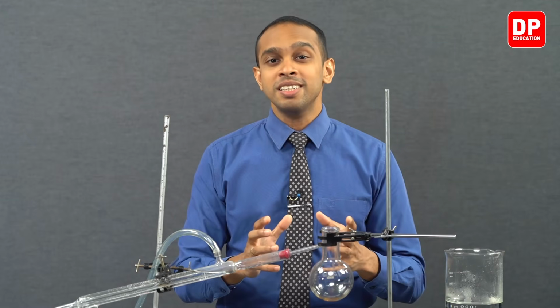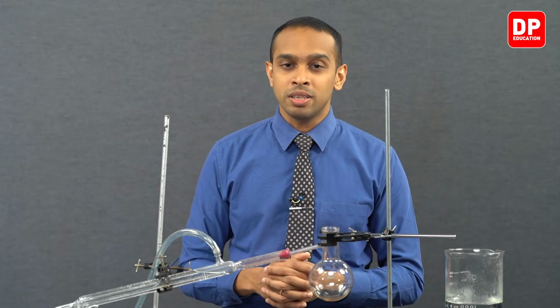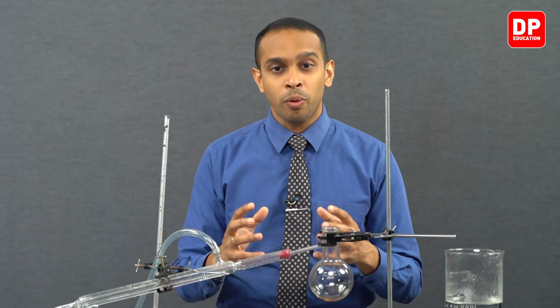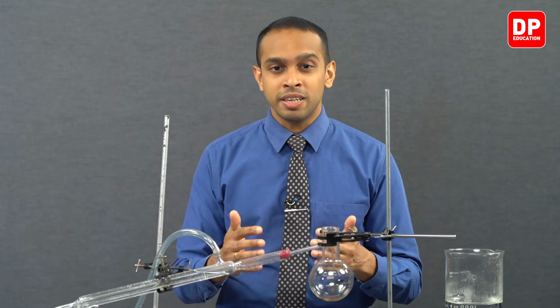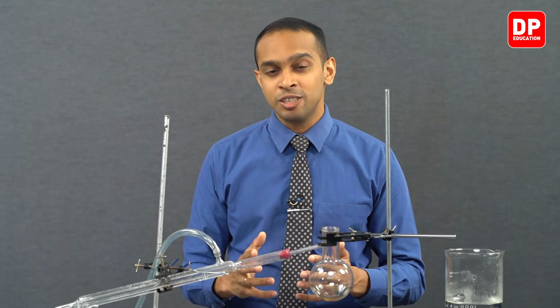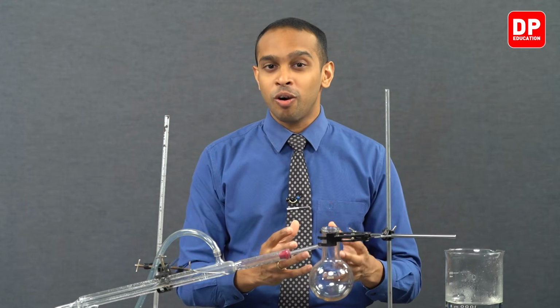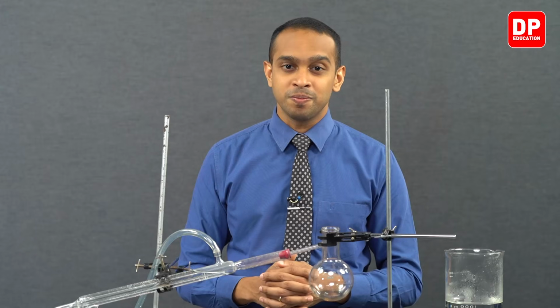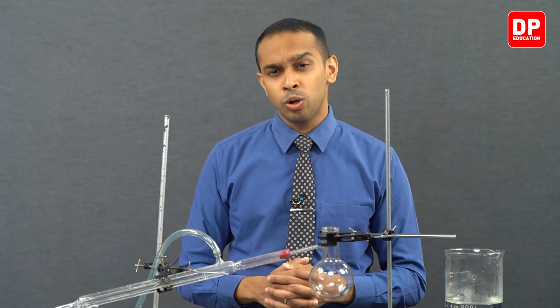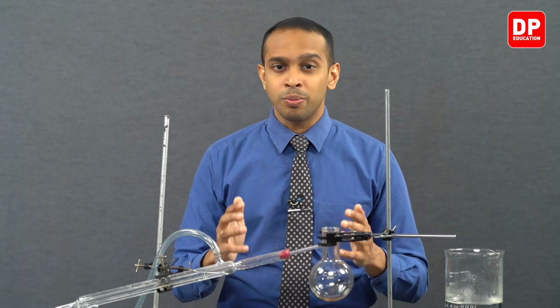However, when the essential oil is mixed with water, since these two are immiscible with one another, the boiling point of the mixture is brought down to a lower temperature. So therefore, we can boil the essential oil at a lower temperature, since the entire mixture will boil at a temperature lower than both of the constituent liquids' boiling points.